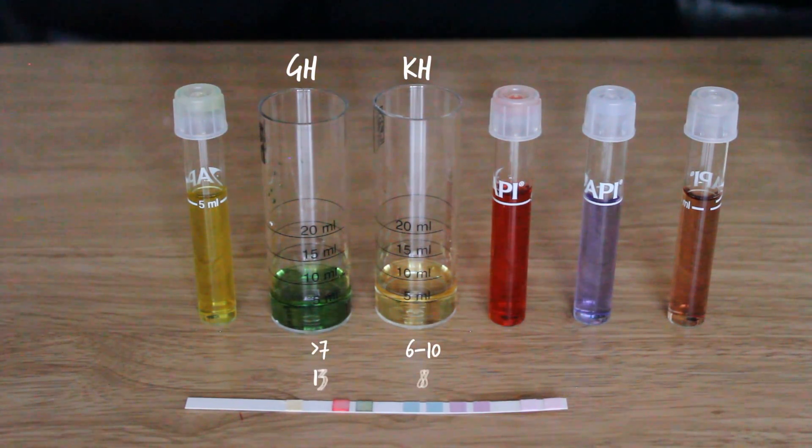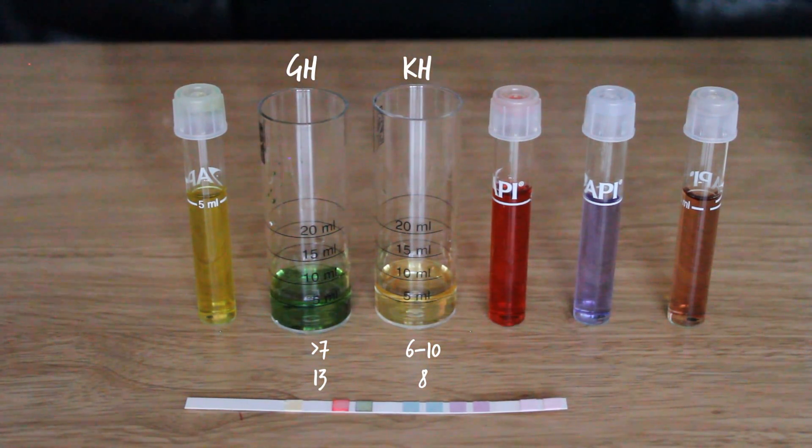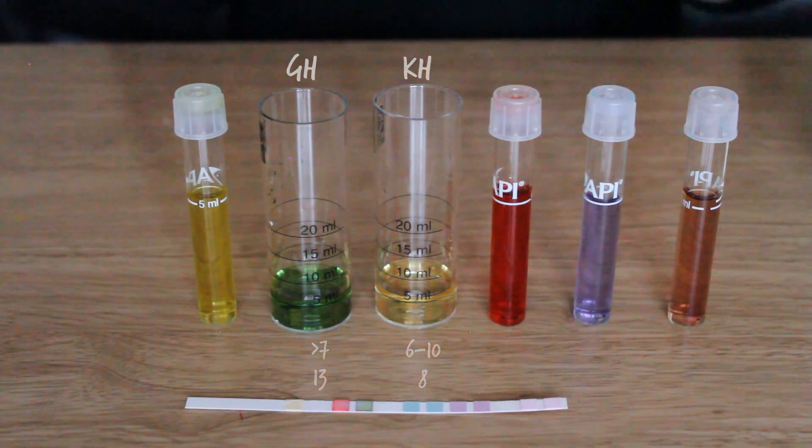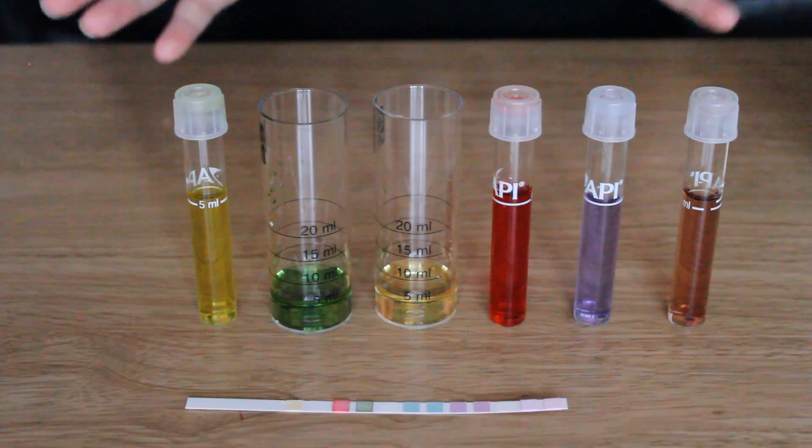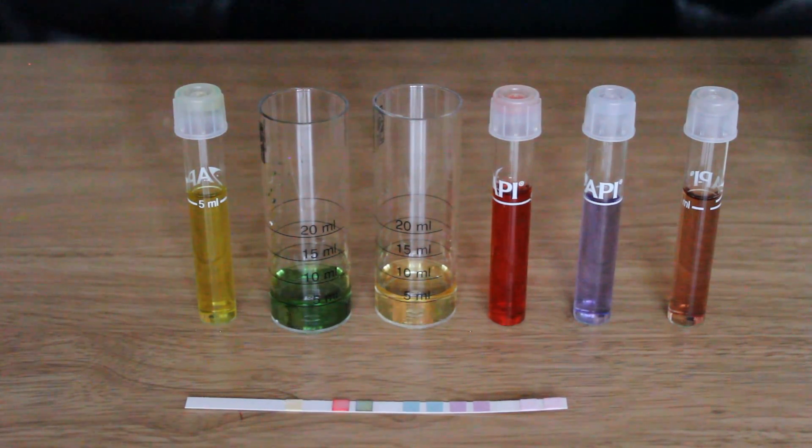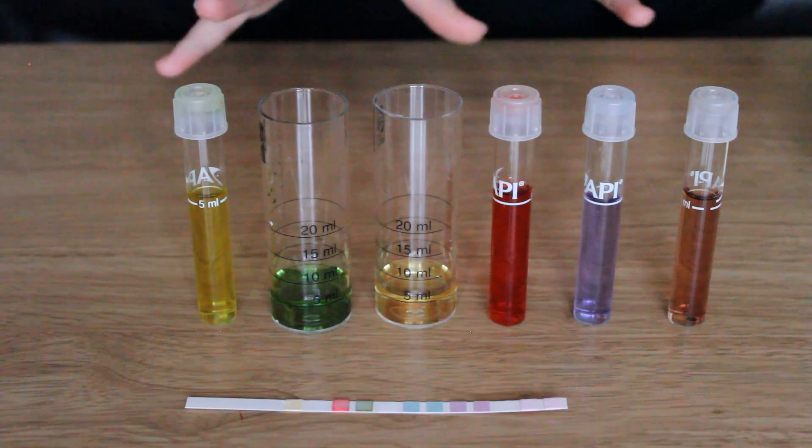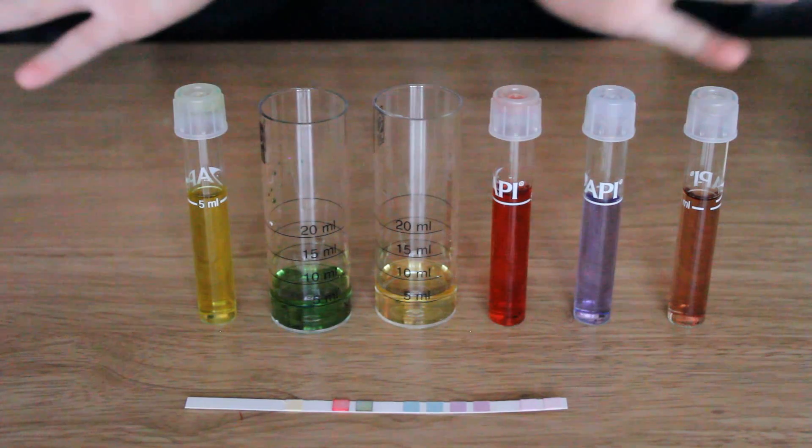Then we have the GH which was the correct amount of drops and same with the KH. So overall the test strip I think is a great indicator and obviously its results aren't far off. I've really enjoyed trying all these out and if you want to know these are all from proshrimp.co.uk. Thank you very much for watching, I hope you've enjoyed this.